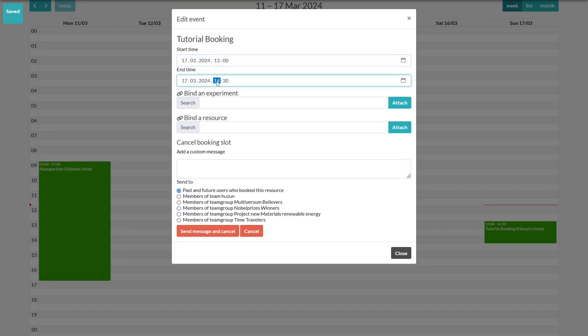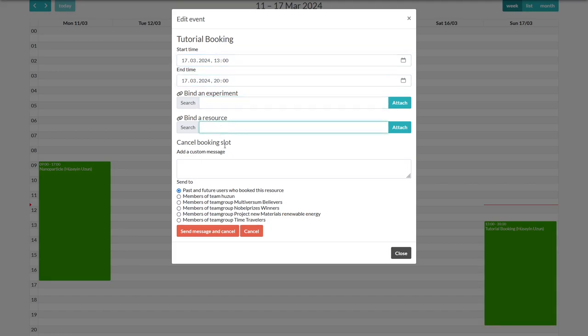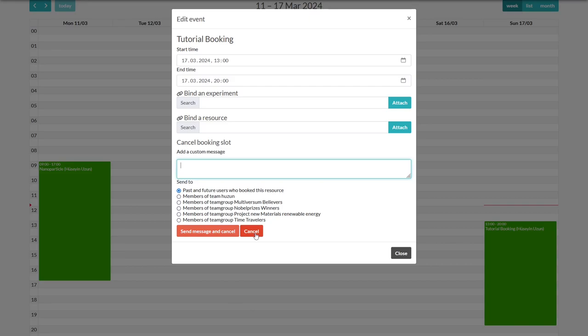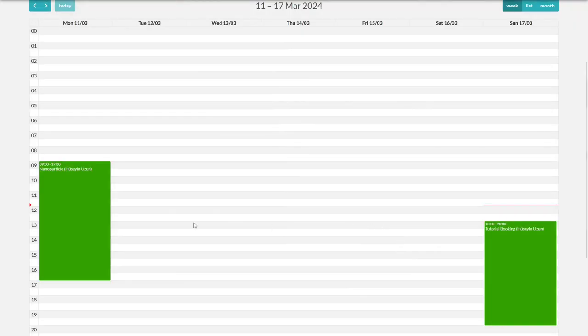You can link an experiment or another resource or cancel the booking and send a message to various groups of people. You can also cancel the booking and not send a message by just pressing on cancel. We will just close it and leave it as it is.